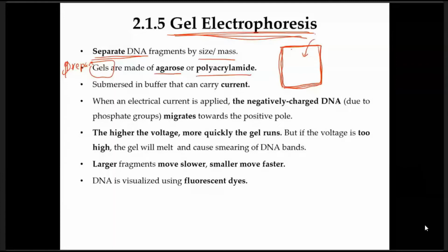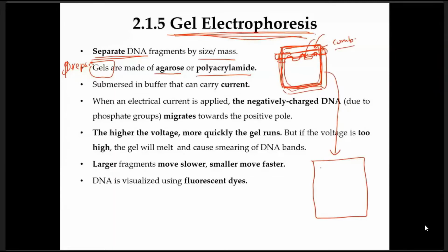The gel that you have prepared will have wells. They have wells, holes. Okay, they have wells. The gel that you have prepared will have wells, where your DNA sample will go.